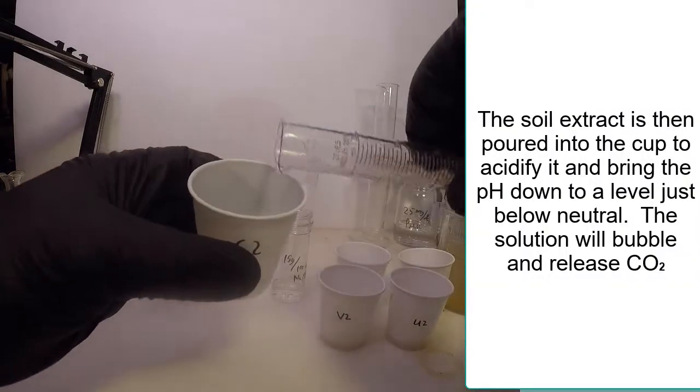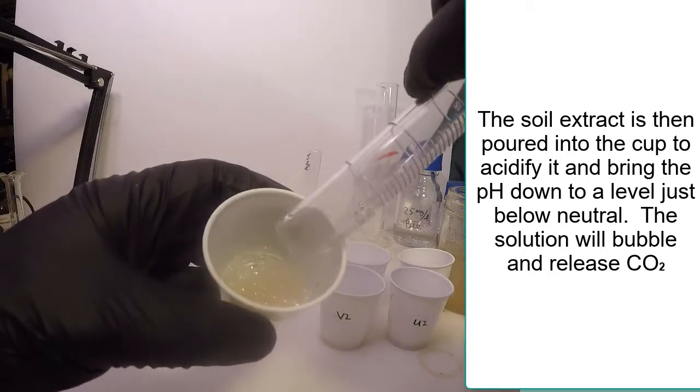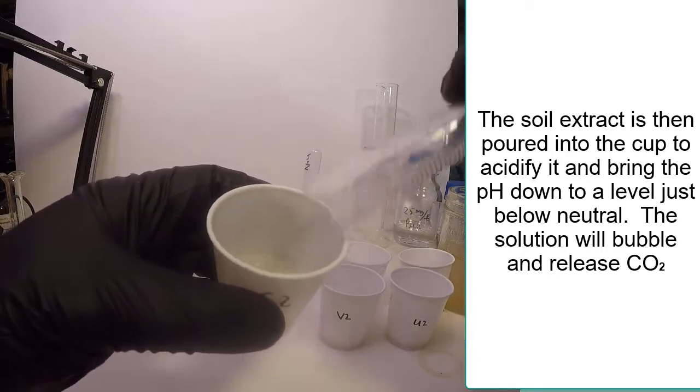Add the 7 ml of extract to the 3.25 ml of sodium bisulfate solution in the cup.